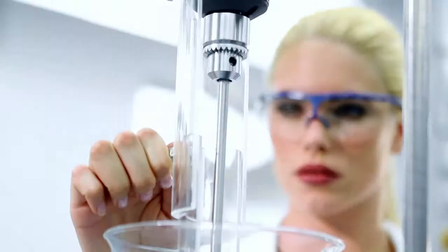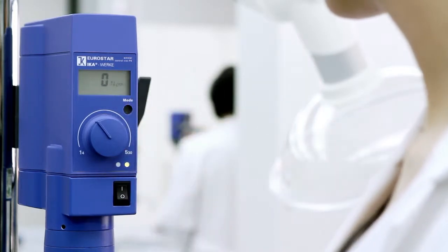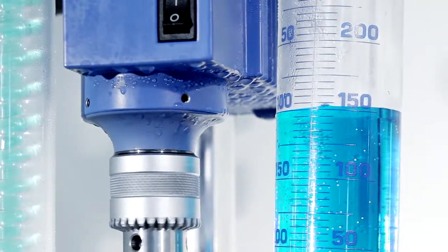Stirring shaft protection available for all units. Integrated torque trend display. IP42 compliant housing reliably protects your unit.